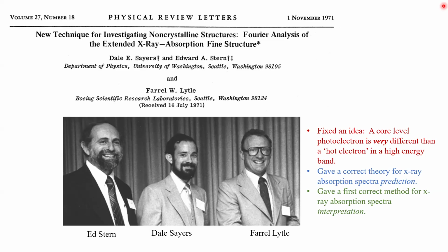You can see that it's called A New Technique for Investigating Non-Crystalline Structures: Fourier Analysis of the Extended X-ray Absorption Fine Structure. And what this paper did is really kind of fascinating.